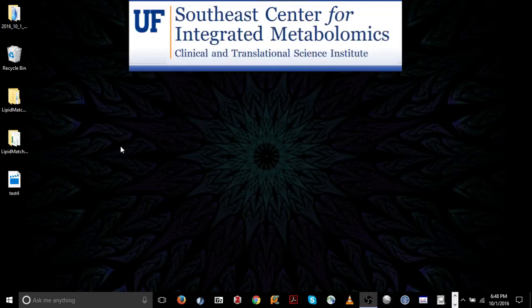So that concludes the interpretation of LipidMatch outputs, and I look forward to seeing you in future LipidMatch tutorials.